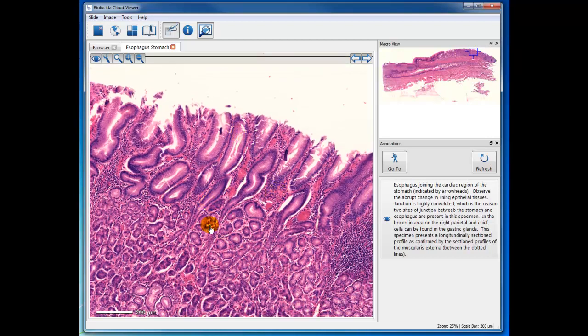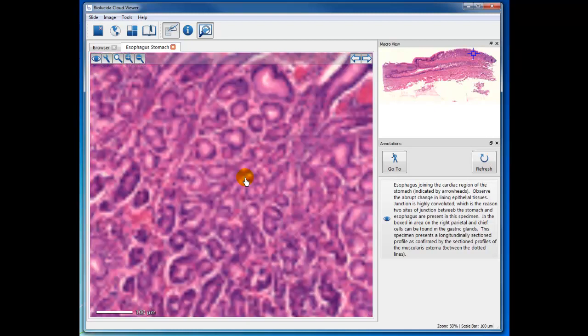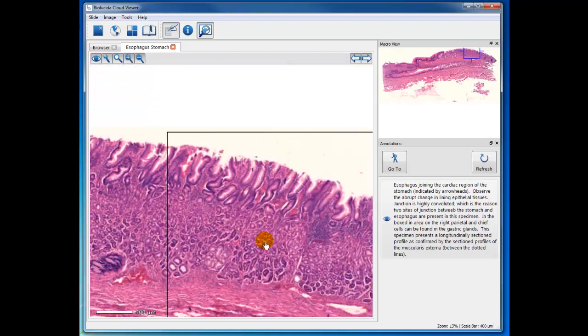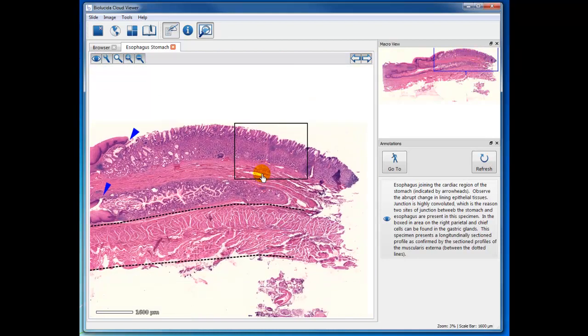Okay, and then down here you've got the gastric glands, where you can see a mixture of the pepsinogen secreting cells that are basophilic, and the reddish cells that are parietal cells. So I think that that's perhaps enough orientation for you to be able to study this esophagus specimen. Remember to correlate what you're learning in a lecture with this lab specimen and the web mic specimens to put the whole story together of the esophagus and the stomach.